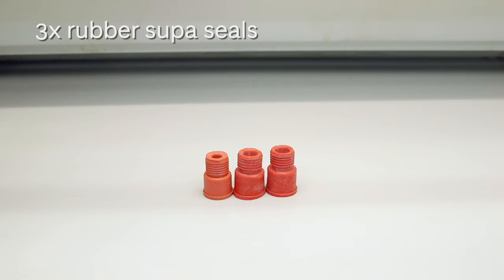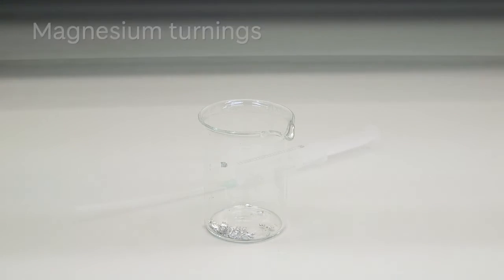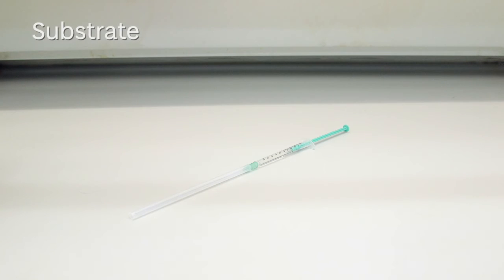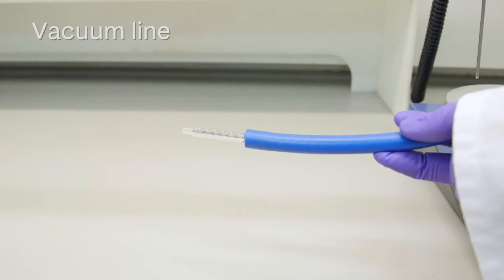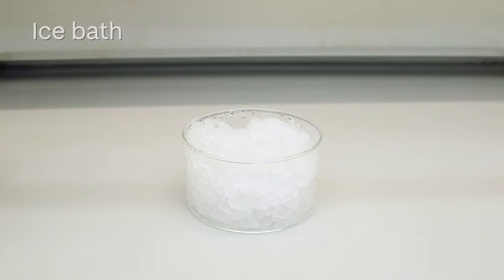Three rubber septa, magnesium turnings, a solvent which can be either THF or diethyl ether, your substrate, a vacuum line, a balloon filled with nitrogen gas, and an ice bath.